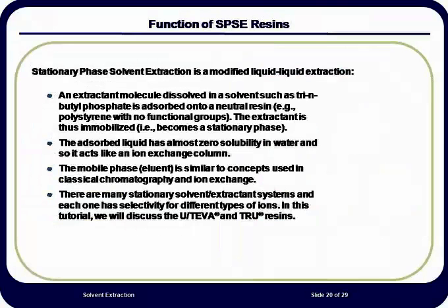The organic molecules used for SPSE usually have a significant viscosity. In order to uniformly coat the resin bead and all the internal channels, a solvent of lower density and viscosity is used to dissolve the organic material and then equilibrate the resin with that solution. After draining off the solvent, the resin is flushed with water, in which the organic material has basically zero solubility.